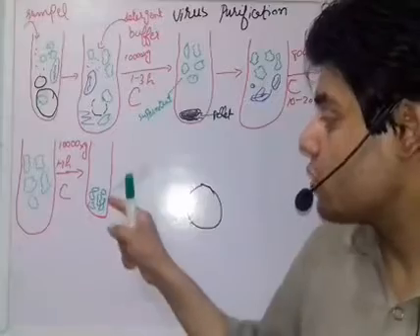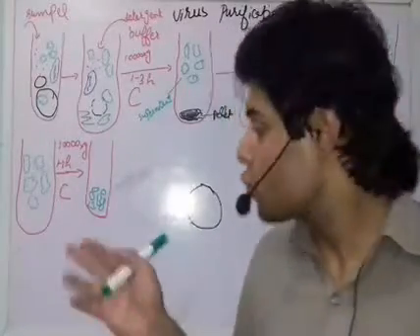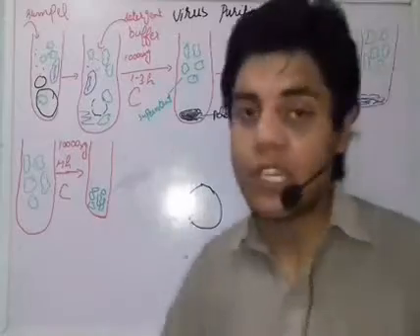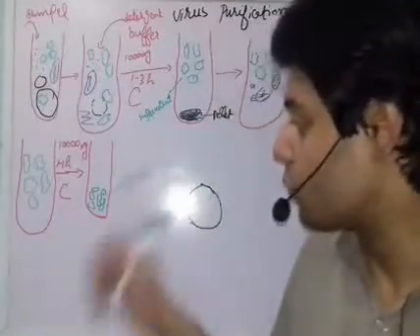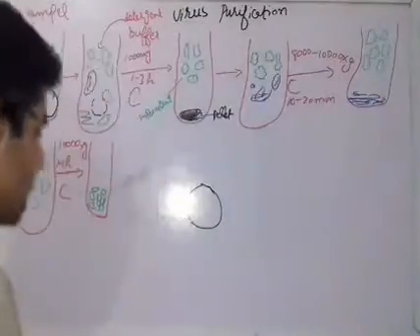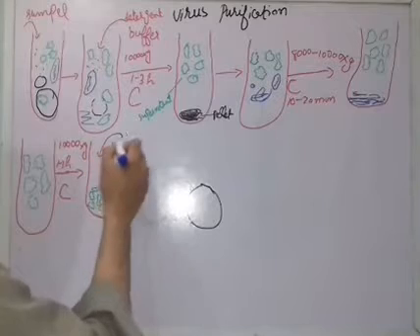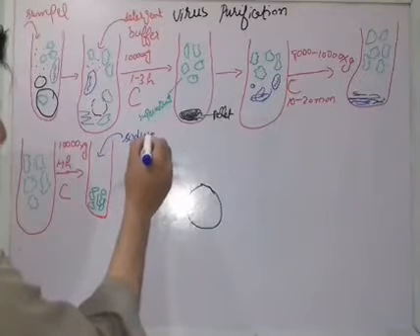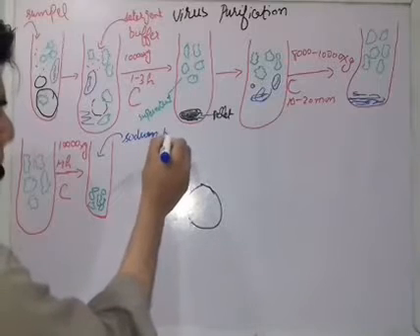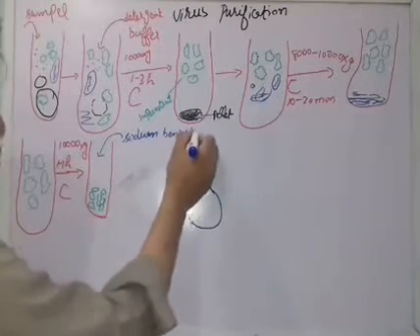Once we put the sodium benzoate, these viruses are washed. Once these viruses are washed, the precipitation will be eliminated, or the precipitation process will be finished. The precipitation will be ended once we load the sodium benzoate. So what we loaded here is sodium benzoate.